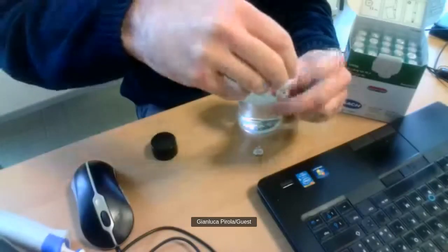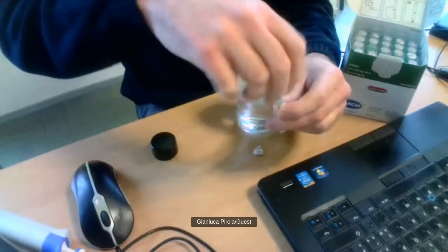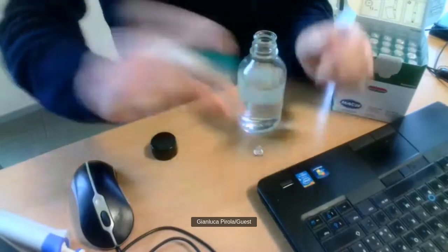I push until the end. Then I screw on with the reagent down and shake.